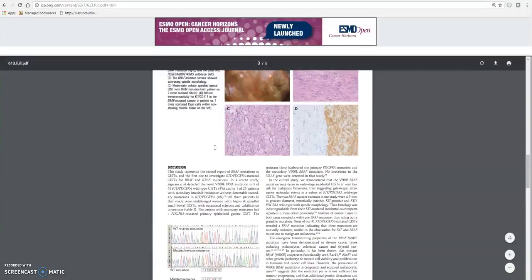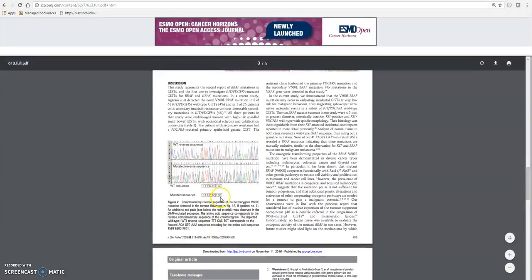Okay, sorry about that. Okay, so what we can see from this is they say the wild type sequence goes CACTGT and the mutated is CTCTGT. Okay, now this might be a bit confusing. What they're showing is the antisense strand to your PCR product. So all you need to do is write this out backwards and reverse antisense it.